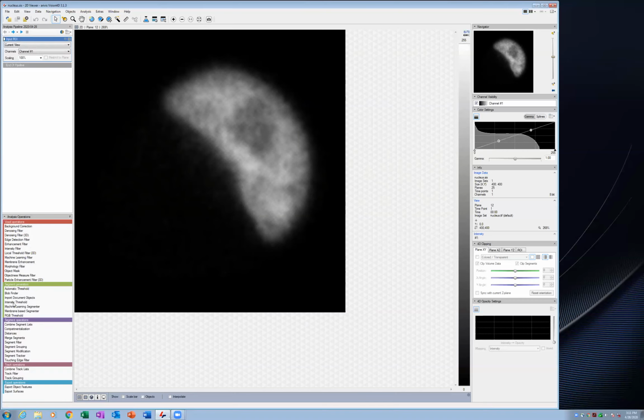But what we go down to here is just grab this intensity threshold option. And I'm just going to drag that up here. And you can see basically this just shows us of our 8-bit image what pixel intensities we're going to grab. So we have an 8-bit image, so it goes from 0 to 255 intensity values. And right now this threshold is set to collect from 104 to 255.